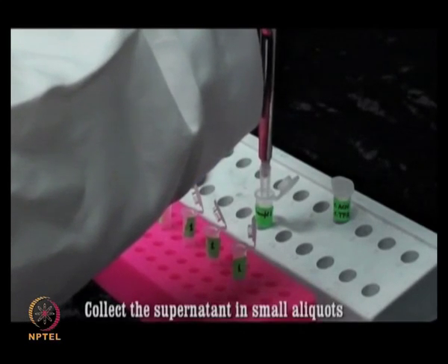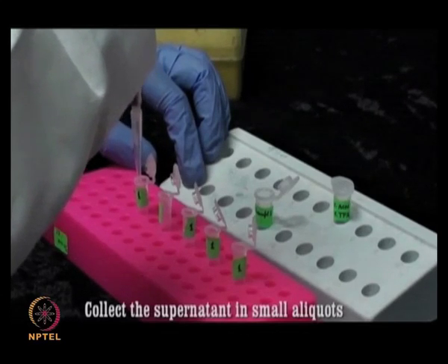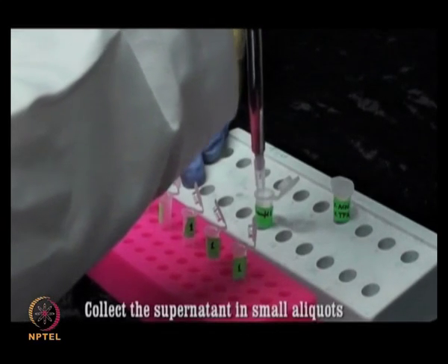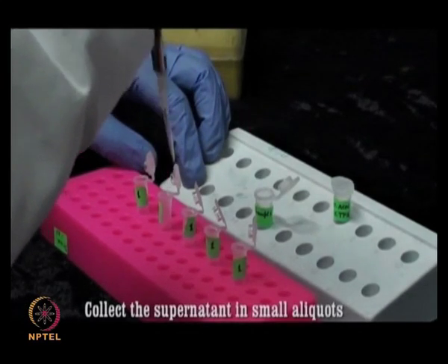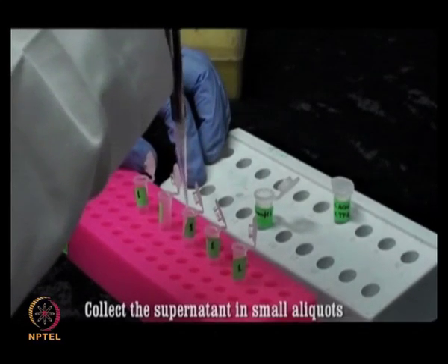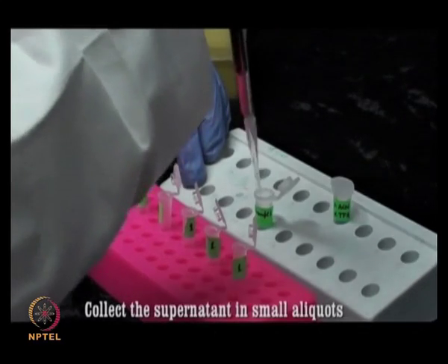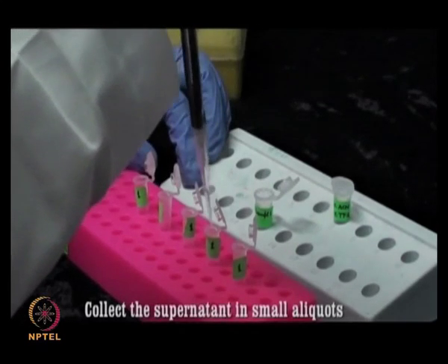Now, collect the supernatant in small aliquots, and extracted samples can be stored in these small aliquots. The efficient extraction process is essential to ensure the release of peptides from the gel matrix to the solution.